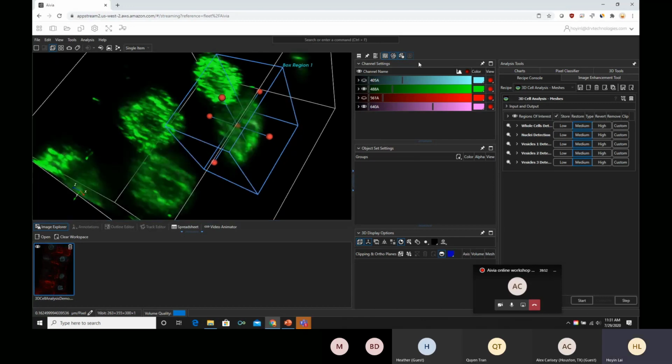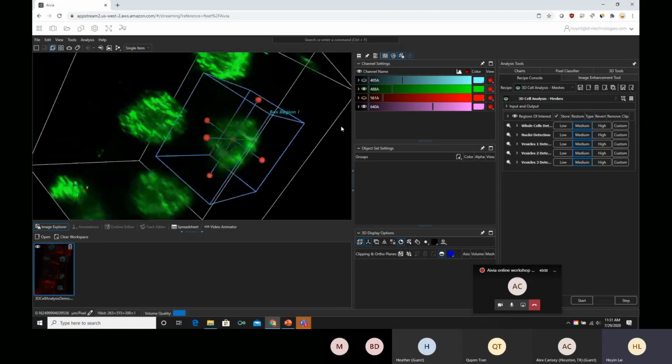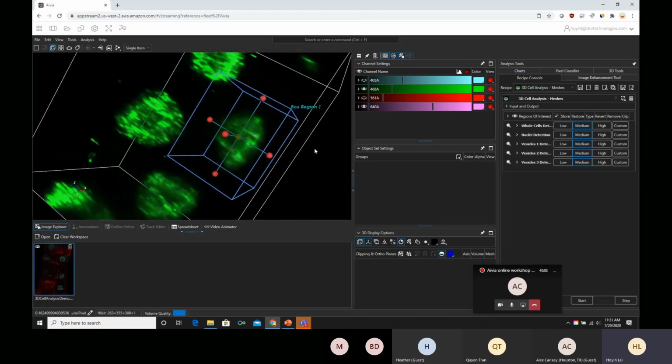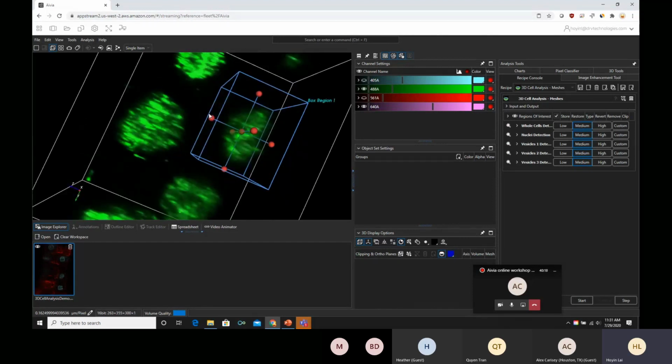When you're using the automatic parameter determination, make sure that your ROI is centered on either a single object or a cluster of objects that are very close to each other. The reason is that the parameter picker determines the parameter based on what is closest to the center of the box. For example, if I extend this all the way out to here, the center is just going to be this empty region, and it will cause the parameter determination to overestimate what the parameter should be.